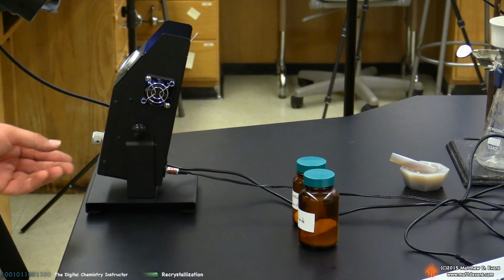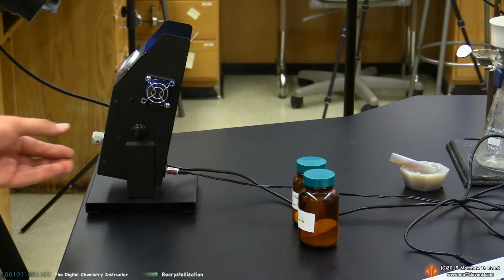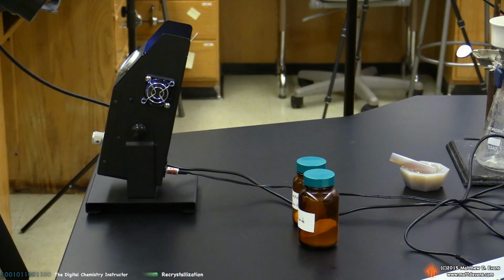Once we've successfully melted our samples, we're going to turn this off, turn it into fan mode, and you'll hear a little fan kick on, and that's going to cool down the melt station so we can use it again as quickly as possible. But otherwise, we've looked at the melting point temperatures of an impure sulfanilamide sample, but also our recrystallized, and we're confident now that it melted at 165, that it's a good sample.